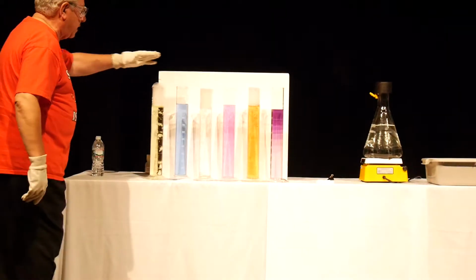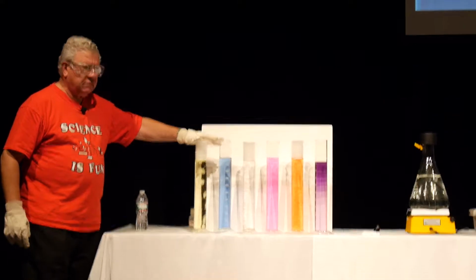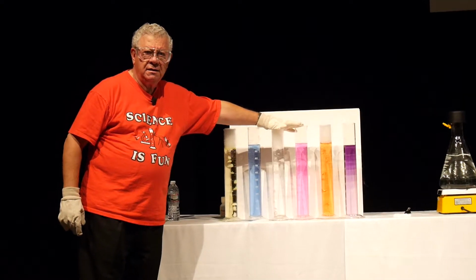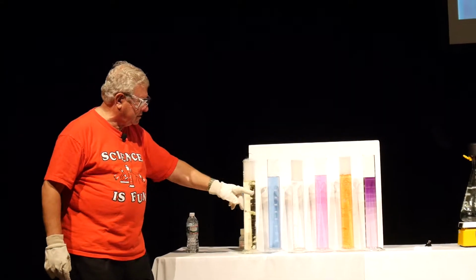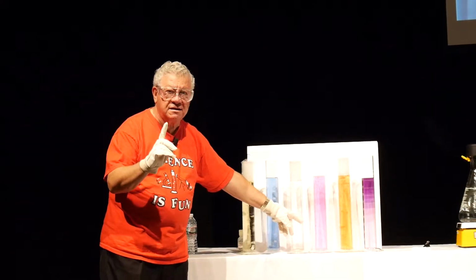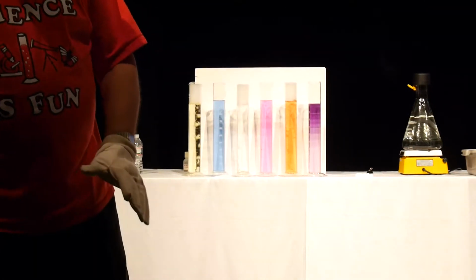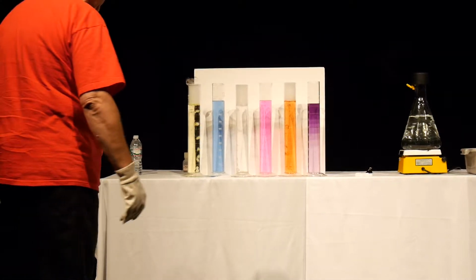So, in this pair, where I put the dry ice in the cylinder that changed color, the color change was from blue to what? Yellow. How about in the middle pair here? It was from pink to what? This is a clear and colored liquid. This is a clear and colored liquid. This is clear and transparent, colorless. From now on, no one in the audience is going to confuse the words clear and colorless. They don't mean the same thing, right? So we have to be careful in reporting our observations.